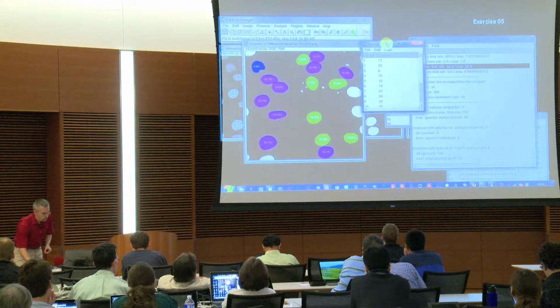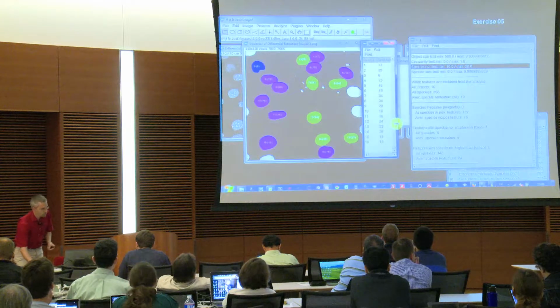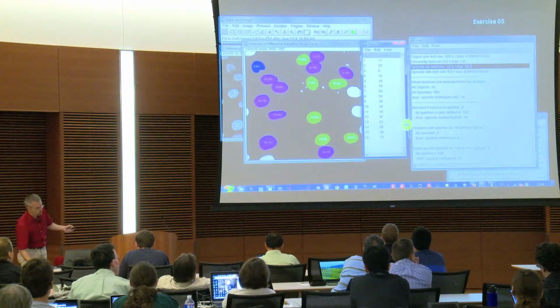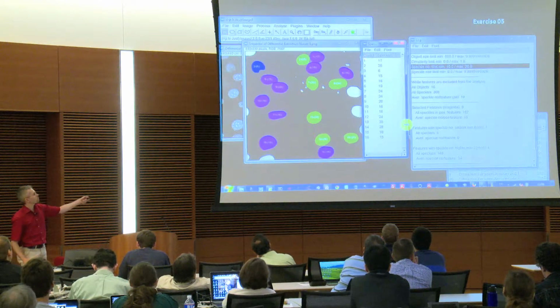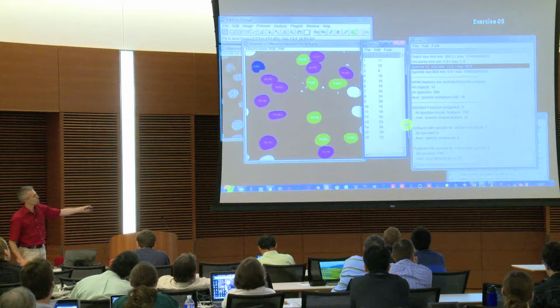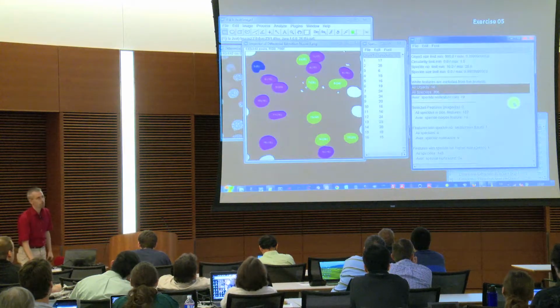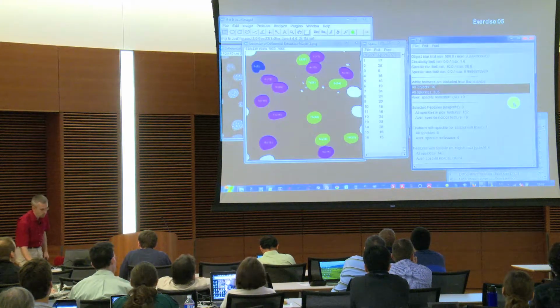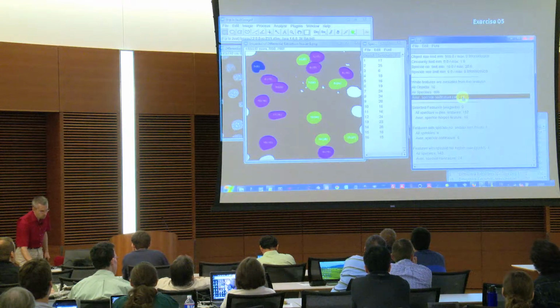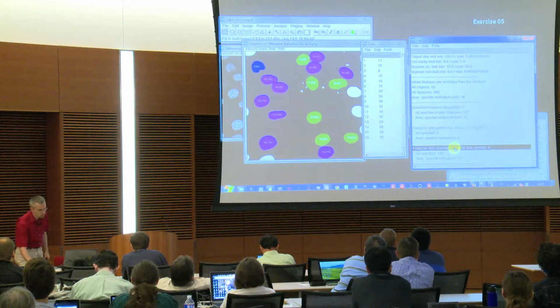I have, in addition, the speckle number list, a speckle list that is nothing else than simply this in numbers. So here is the object number, which corresponds to the first one, and the number of speckles, which corresponds to that column. Here is average statistics, as we had before, 16 and 306. The average of that, and then separated by color, so the magenta ones, the blue ones, and the green ones.